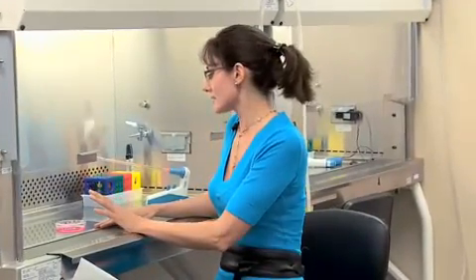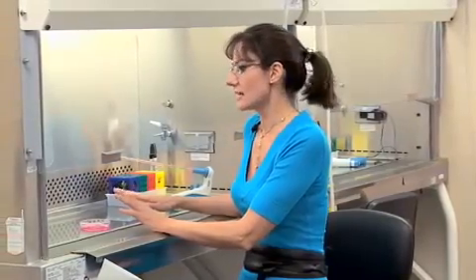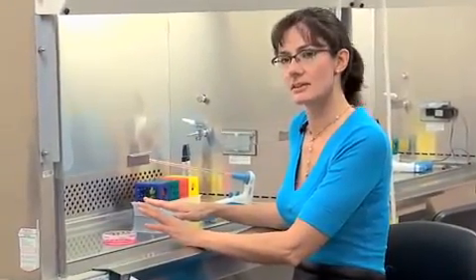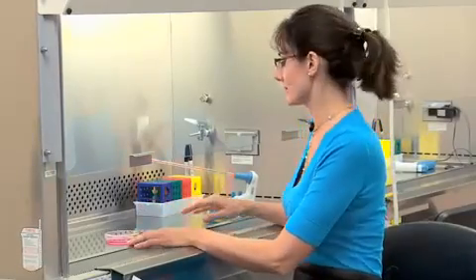Working with the cells in a biosafety cabinet allows us to prevent the introduction of any extra microorganisms into the culture. It also protects the researcher from any potential hazard that could be in the culture from reaching us.